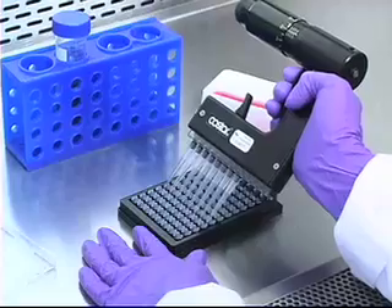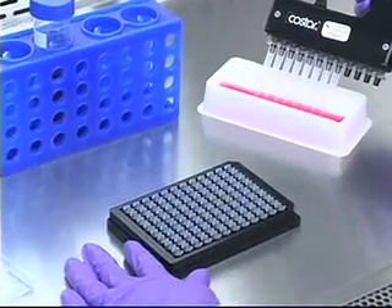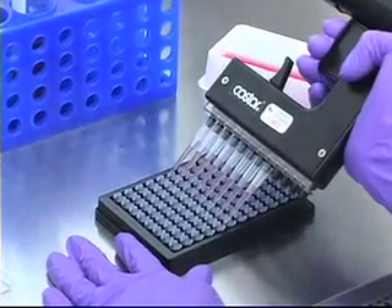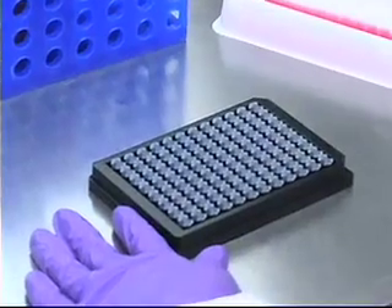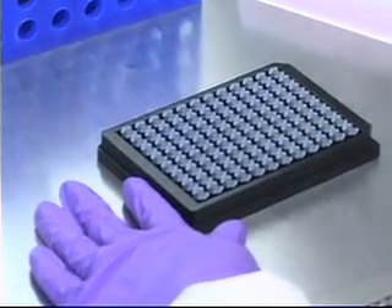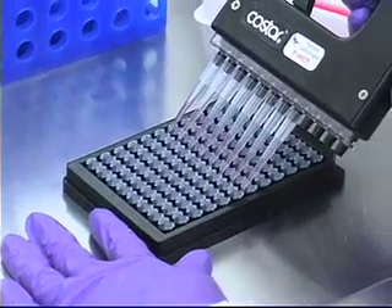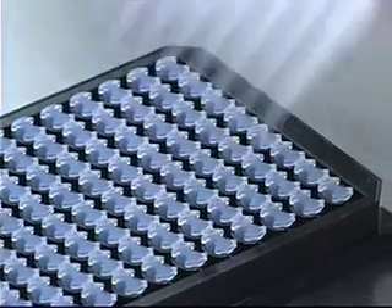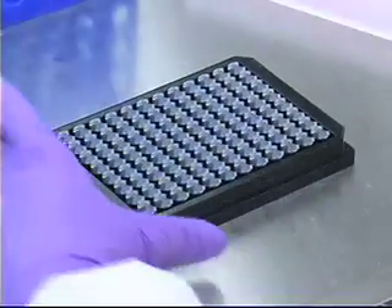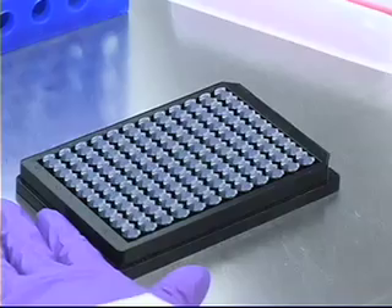The Oris cell migration assay has been designed to work with adherent cell lines, such as HT 1080 fibrosarcomas, 3T3 Swiss albino fibroblasts, and HCEC epithelials. Allow cells to reach 80% confluency, harvest, and then aliquot 100 microliters of cells into each well. The optimal number of cells will be dependent upon your specific cell line. Lightly tap the plate on your work surface to evenly distribute the well contents.